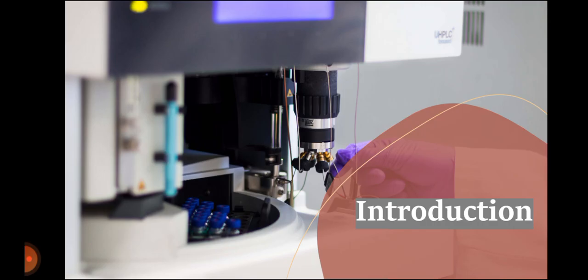In this presentation, we will discuss the introduction of mass spectrometry, that is, what is mass spectrometry, then we will discuss its principle, then instrumentation, how its parts are assembled, and at the last we will see its costing.